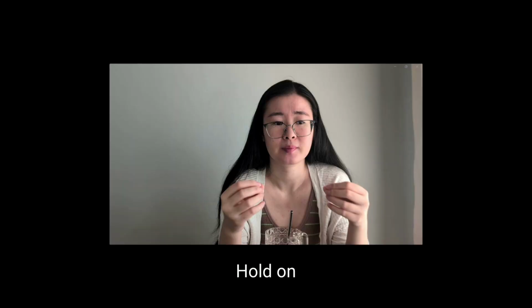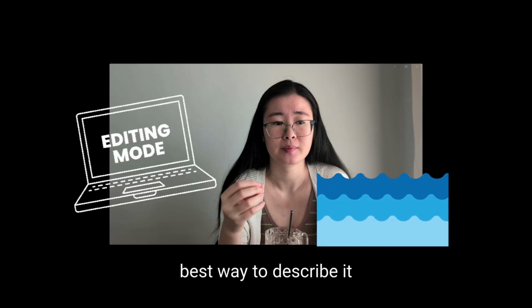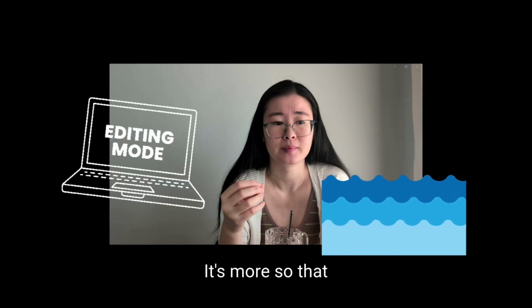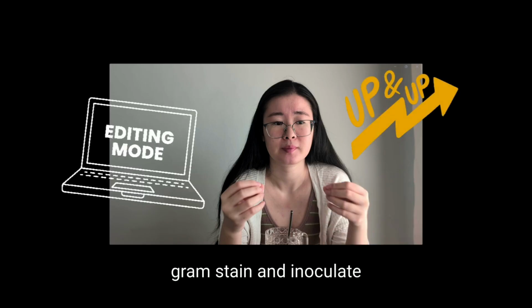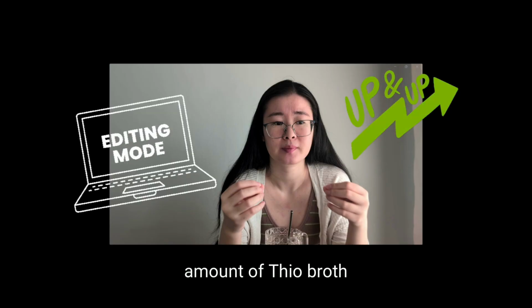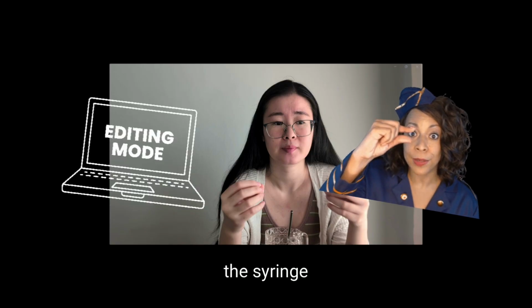Or we have to probably dilute your original sample just so we can even get this growing process to start. Hold on, while I'm editing this video, I think dilute is really not the best way to describe it. It's more that we need enough liquid volume to make the gram stain and inoculate all the culture media, by adding the minimal necessary amount of soy broth into a sample you send us for full workup but which only contains 1 drop of pus in the syringe.